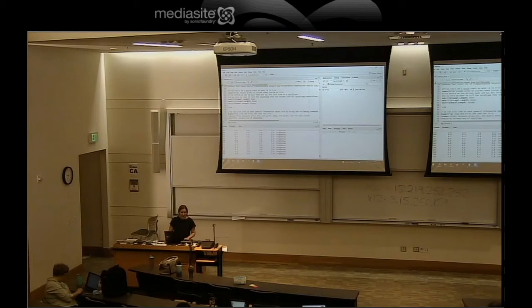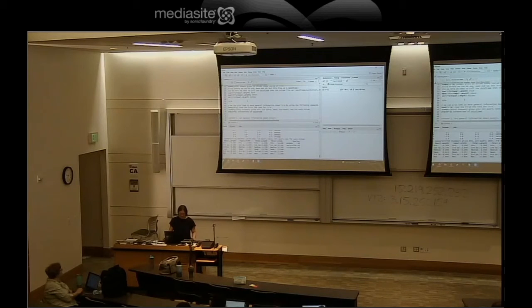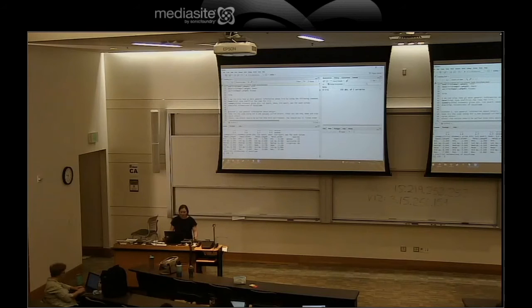So you can run a head command just like you can on command line. The syntax is a little different, but it will do the same thing. We'll see just the top of this file. And the same goes with tail. Head and tail are top and bottom. The summary of a data frame will give you some of those summary stats, but for the whole data frame, in a form where you can see, okay, what am I dealing with: quartiles, means, medians, to give you a general sense of the shape of your data. Dimensions is useful if you're like, how many rows are in this thing? How big is it?